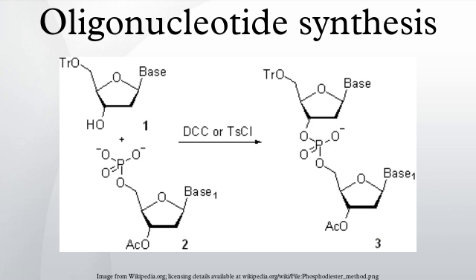column or the well. Solid support material. In contrast to organic solid phase synthesis and peptide synthesis, the synthesis of oligonucleotides proceeds best on non-swellable or low-swellable solid supports. The two most often used solid phase materials are controlled pore glass and macroporous polystyrene. CPG is commonly defined by its pore size. In oligonucleotide chemistry, pore sizes of 500, 1000, 1500, 2000, and 3000 Å are used to allow the preparation of about 50, 80, 100, 150, and 200 mer oligonucleotides, respectively.